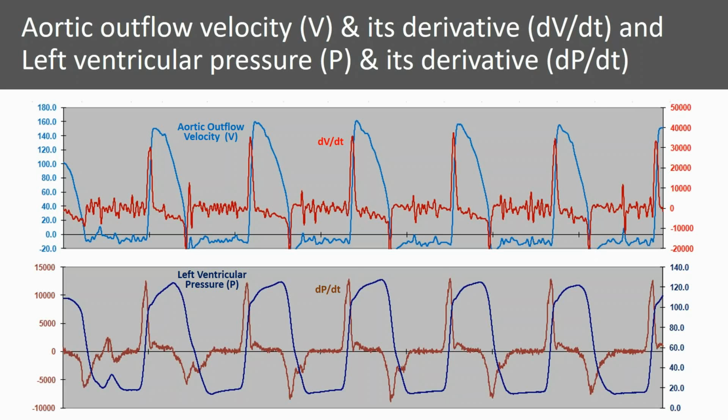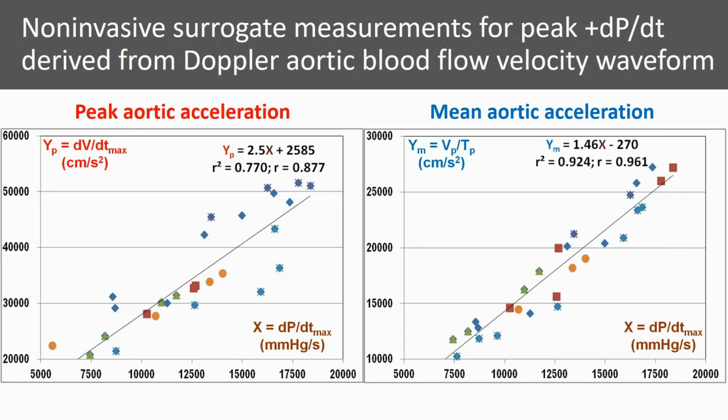On the next slide, I'll show you the data that we obtained. This is some of the data from 6 mice. We had several data points. We had seen heart rates of 387 on the lower side at baseline, and we also gave dobutamine to get responses as high as 700 beats per minute on the heart rate.